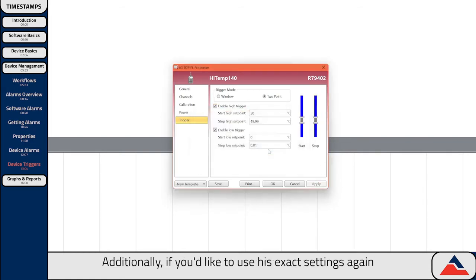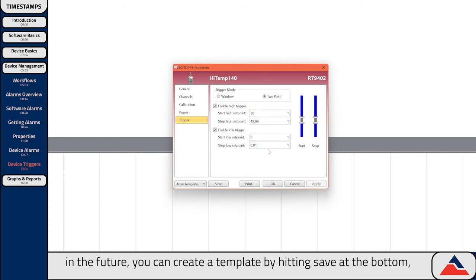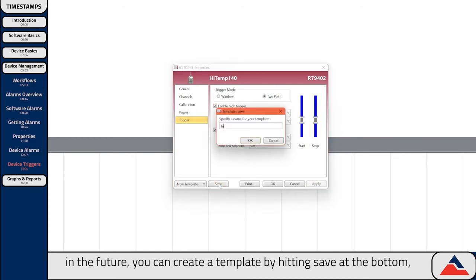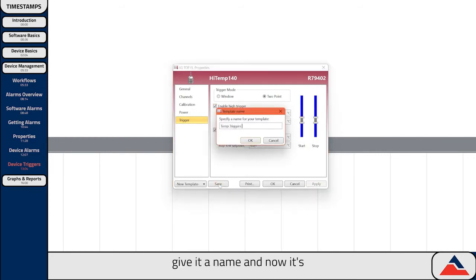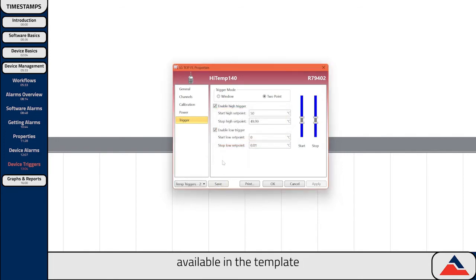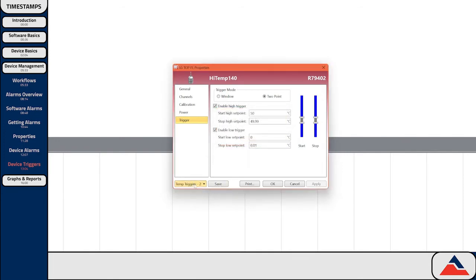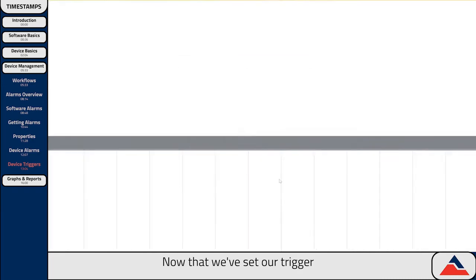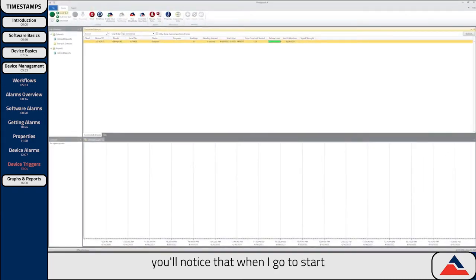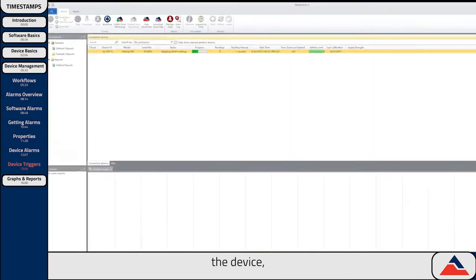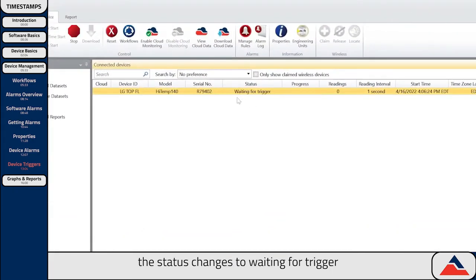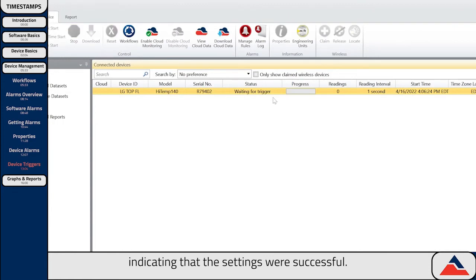Additionally, if you'd like to use these exact settings again in the future, you can create a template by hitting Save at the bottom. Give it a name, and now it's available in the template drop-down menu to be applied automatically in the future. Now that we've set our trigger, you'll notice that when you go to start the device, the status changes to Waiting for Trigger, indicating that the settings were successful.